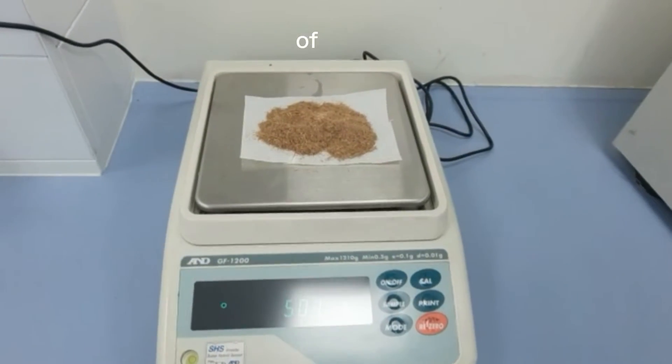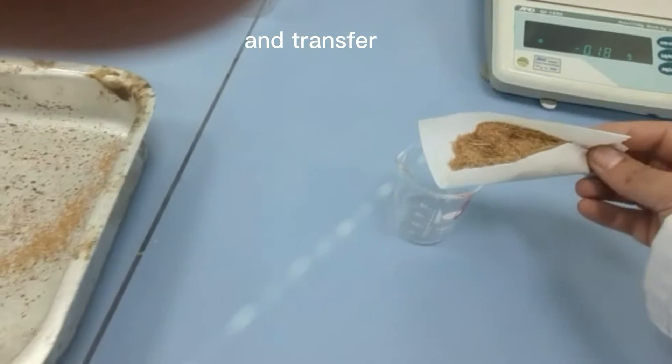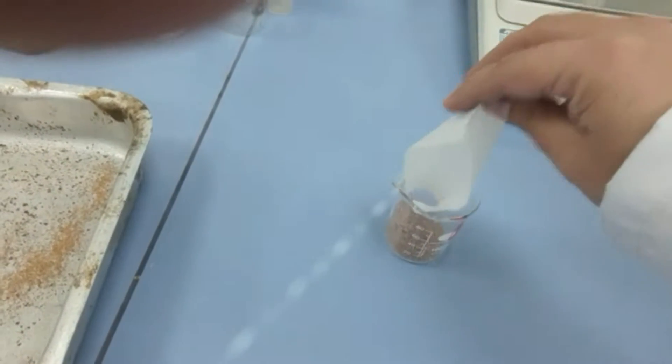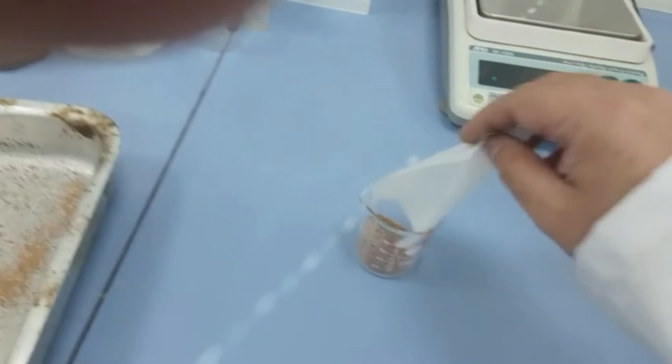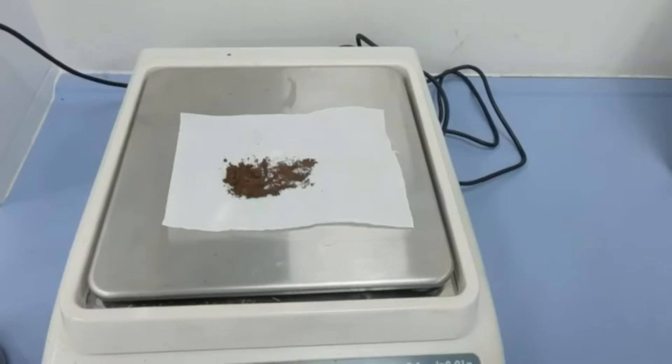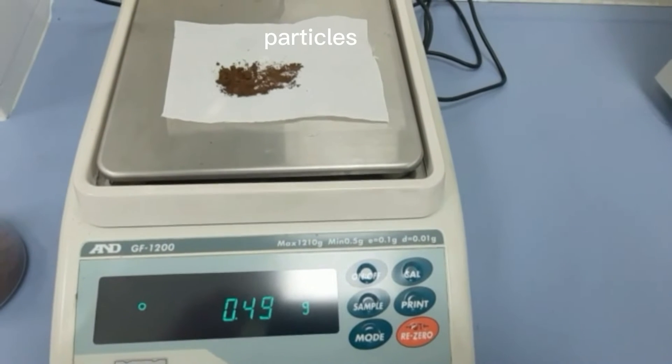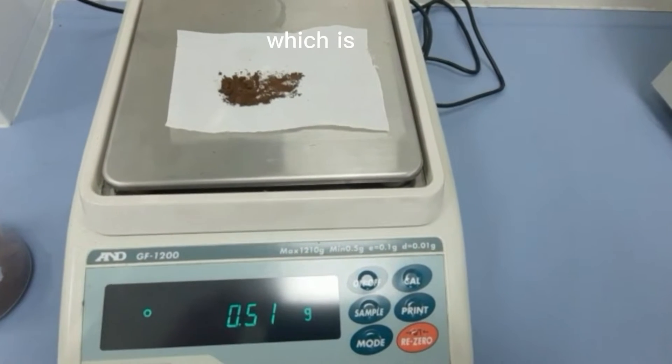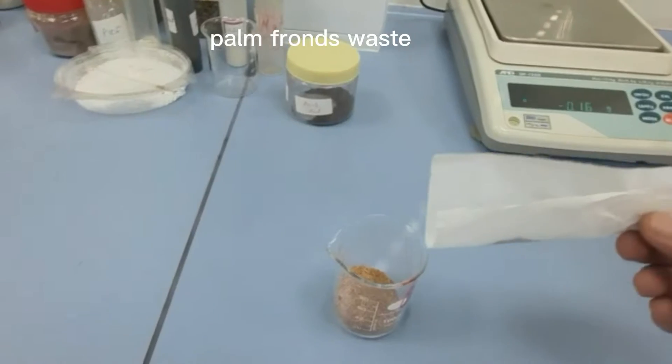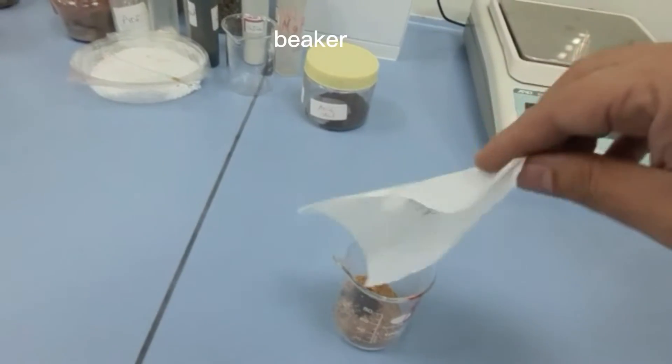Now weigh 5 grams of date palm and transfer into a beaker. The second step is to weigh 0.5 grams of magnetic particles, which is about 10% of date palm. Transfer the magnetic particles into the same beaker.